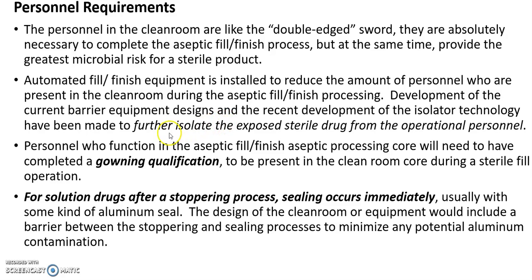Okay, so we minimize the exposure of the sterile drug to the personnel. That's the goal. And personnel who function in the aseptic fill finish processing will need to have completed aseptic gowning qualification, because that's the cleanest environment. So make sure they are all aseptically gowned.